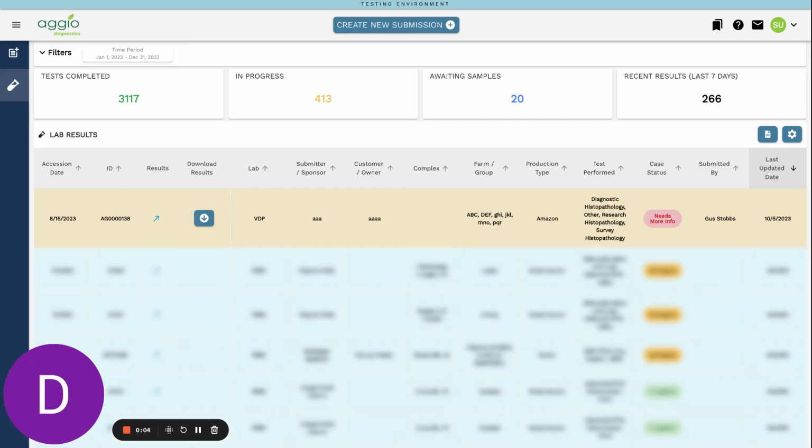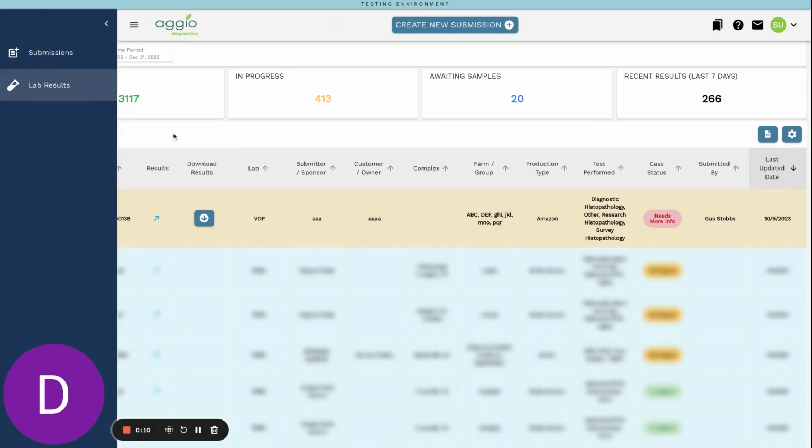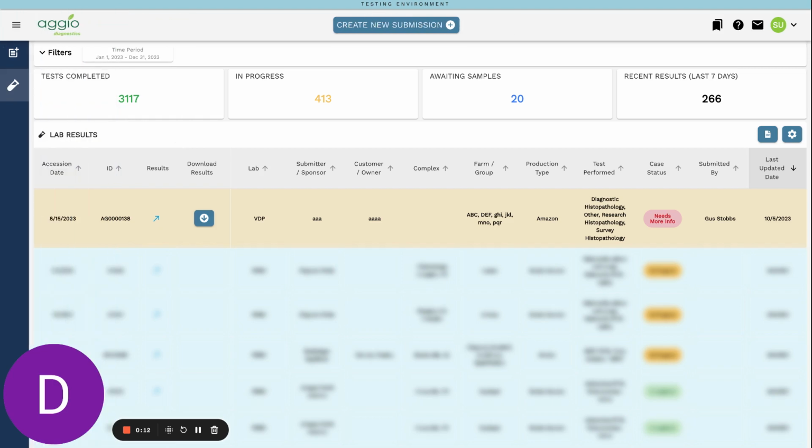I'm CEO of Aggio, and today I will train you on how to use the Aggio Diagnostics platform results tab. A key thing to note is that under lab results, you will only be able to see the individual results that are assigned to your specific email ID.